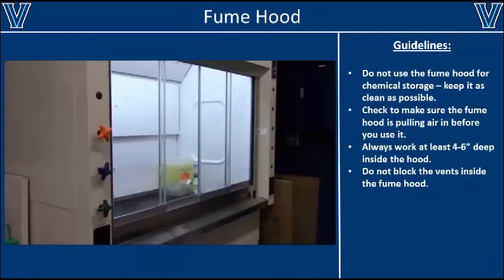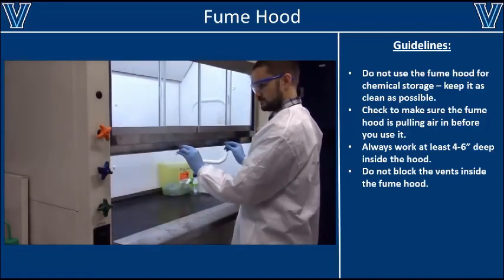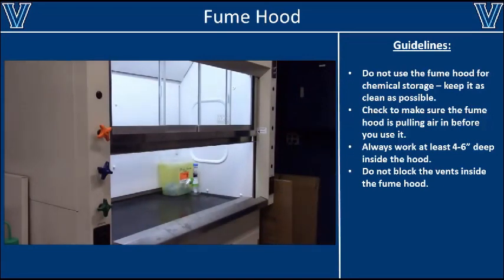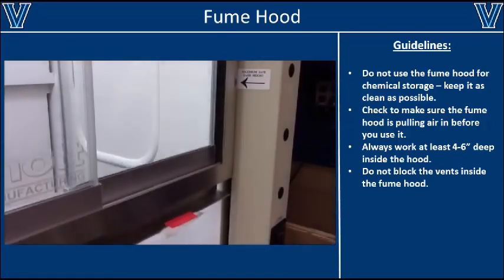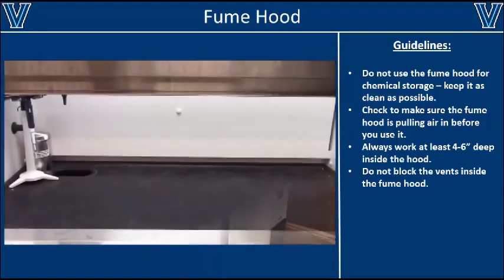If you work with any hazardous chemicals in your research, you'll probably need to use the fume hood at some point. To begin working in the fume hood, raise the sash to the maximum safe height. Note that if you raise it too high, the fume hood will not work properly and some vapors may escape into the lab. When you raise the sash, it should start drawing air inwards. If there is no airflow or any alarms go off in the hood, you should let your supervisor know immediately and not use the fume hood.